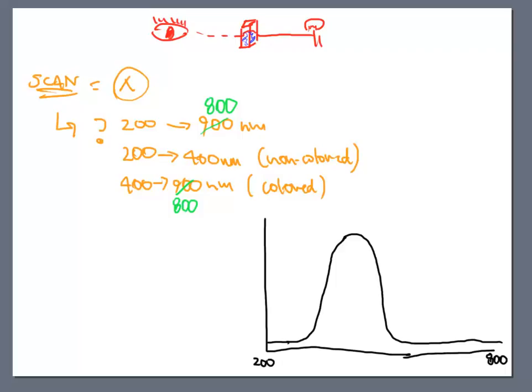Okay, well, we have a term for this. This is called the spectrum. All molecules have a spectrum. They can be simple. In this case, the molecule liked one item on the buffet line, and that was it. Didn't want any others. There are molecules, though, that are a little greedy, and they like to hoard up food on their plate.